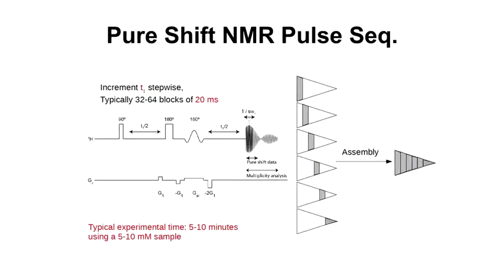It's complicated, and unless you know a lot about pulse sequence design, it won't make too much sense. But what's illustrated here is a spin echo type experiment, but there's a gradient that's applied. And you increment the T1s stepwise, just like you would do in a 2D experiment. Then you acquire during the acquisition period over a very, very short time, just a few tens of milliseconds. And you repeat this. What's illustrated there is where you're acquiring in the FID.